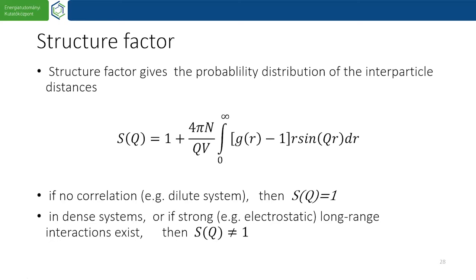So if we have a system in which there is no electrostatic interaction, we still have this excluded volume effect. And for this case, the diluteness starts to be true somewhere around 1 or half a percent volume fraction of the particles in the system.